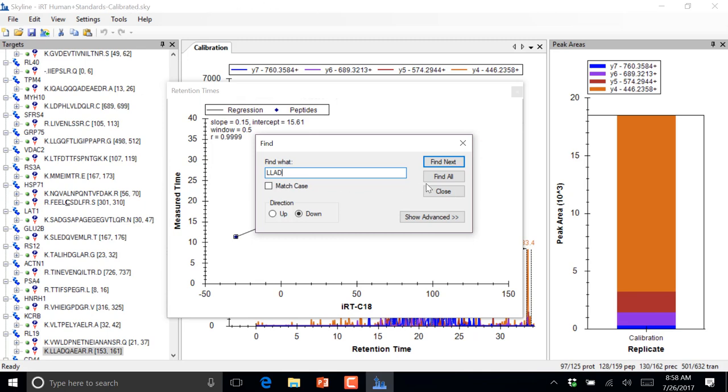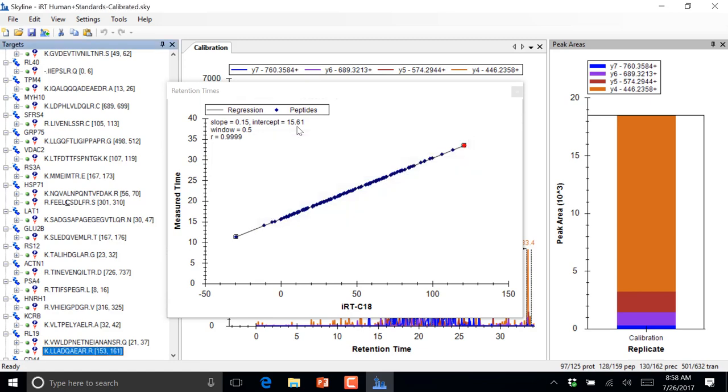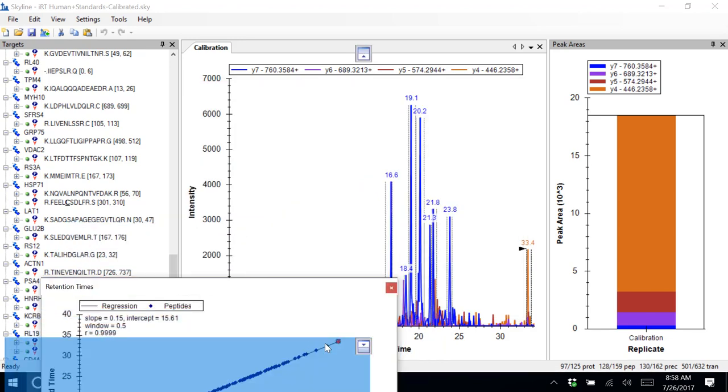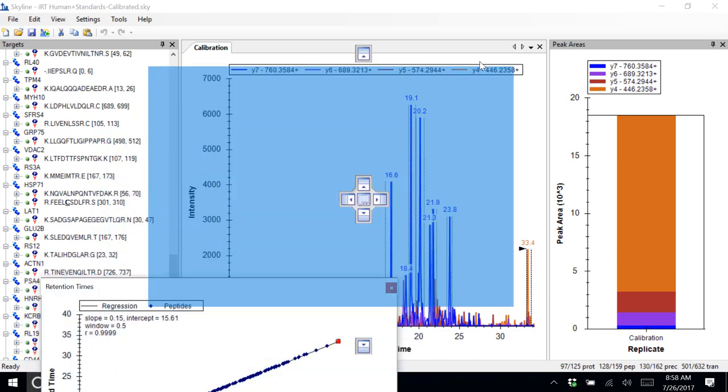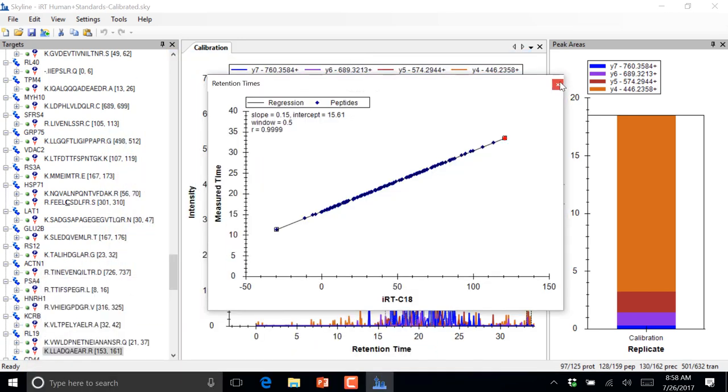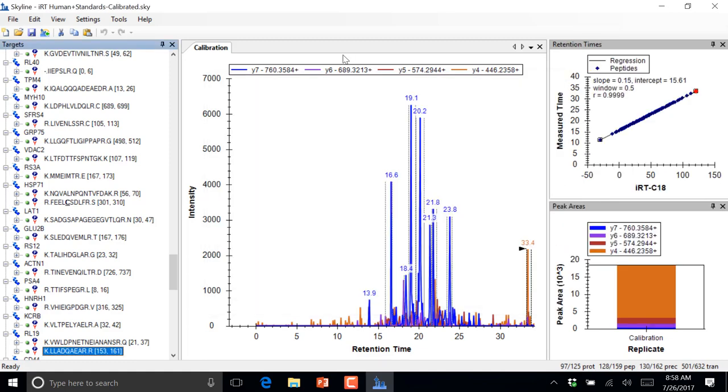Okay, so this gives us some view into, oh, that's kind of interesting. So I guess I'll put this back.